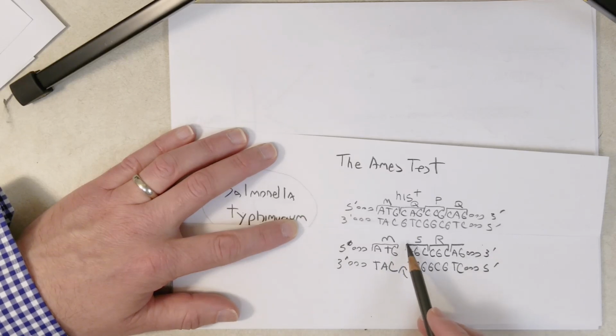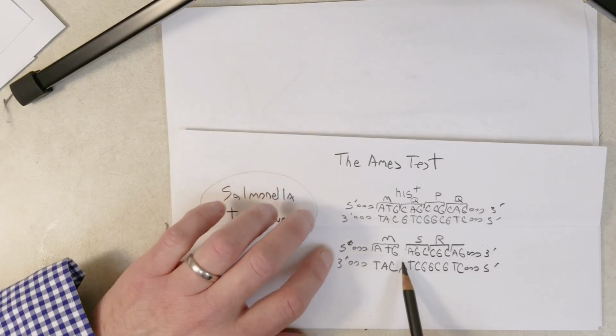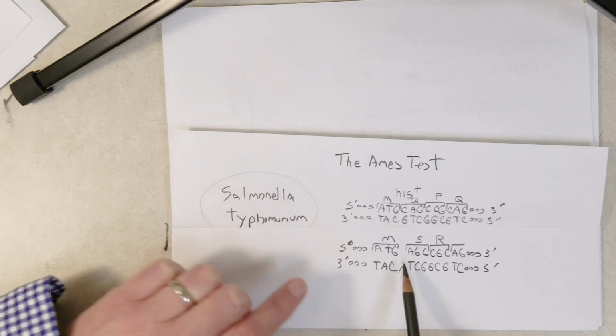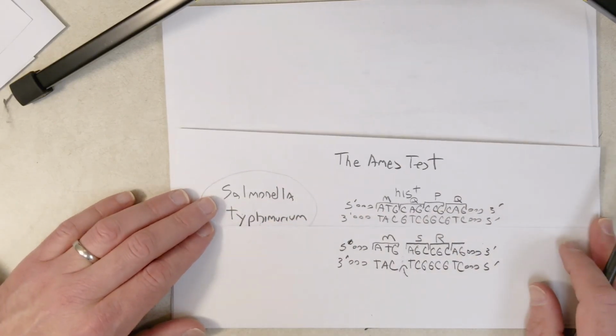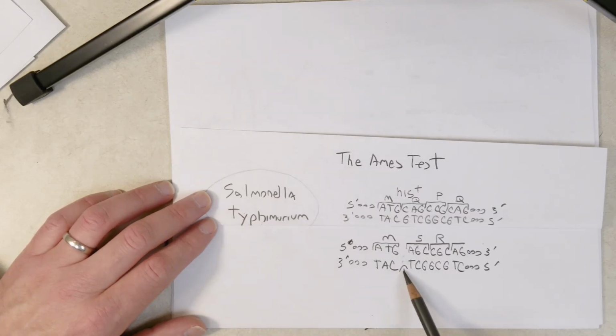So I hope that makes sense. So we can use this type of strain right here that has a deletion in the histidine gene to test if a chemical is mutagenic, but mutagenic in a way that is more likely to cause deletions or insertion mutations.